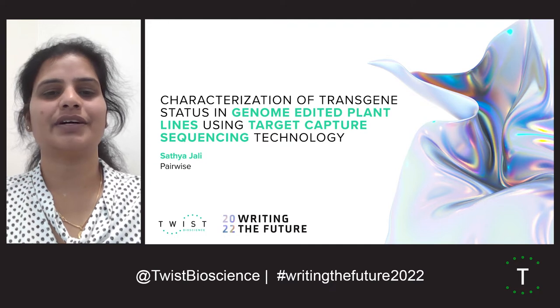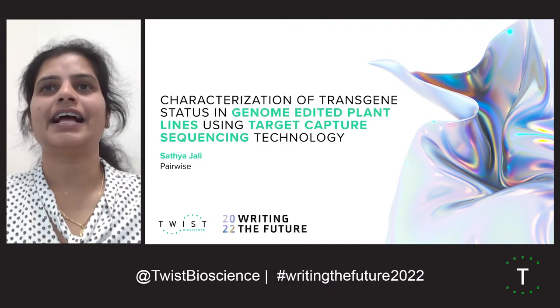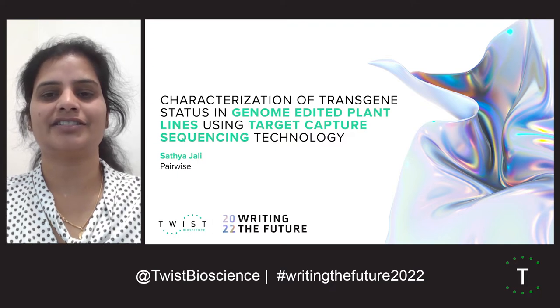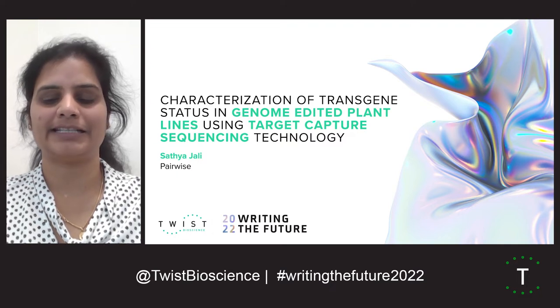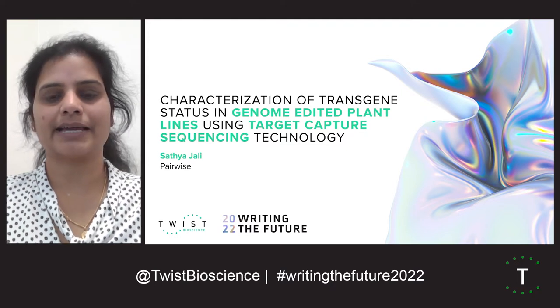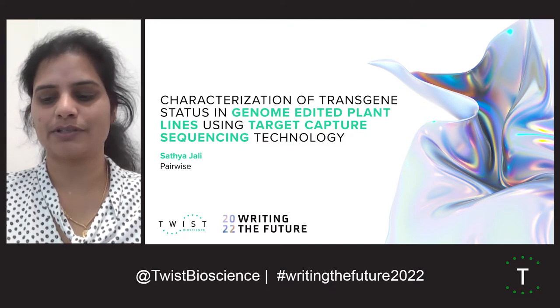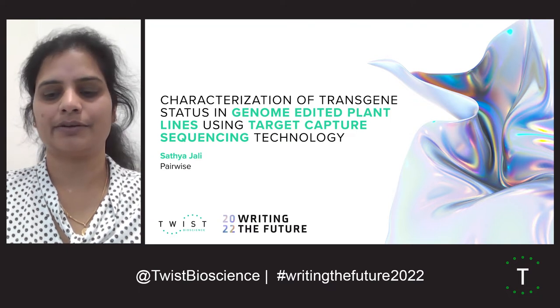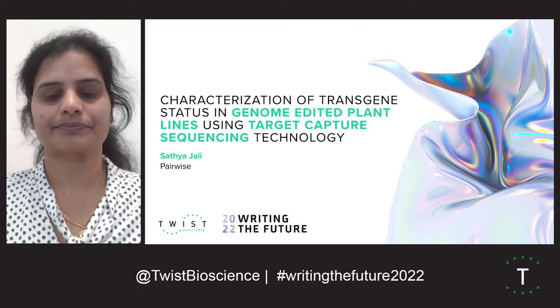Today I'm going to talk about target capture sequencing technology, and how we used it for the confirmation of transgene status in genome edited plants. Before I get to the target capture methodology, I just want to talk about where we are as a company and what we do.